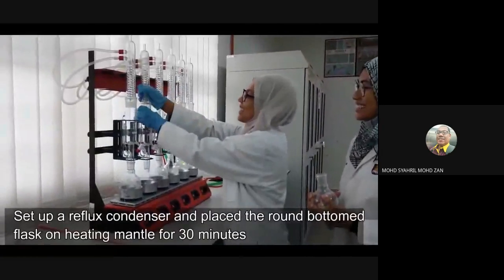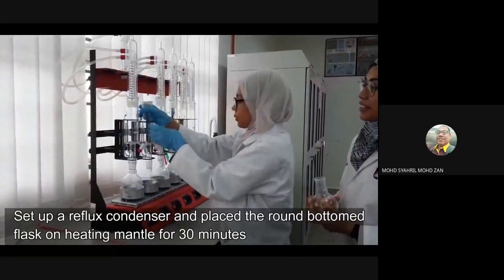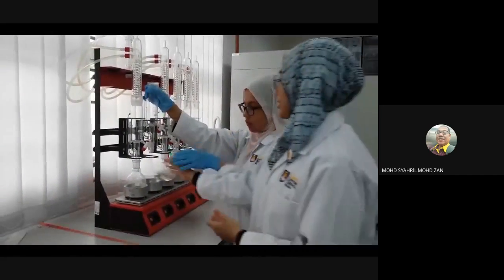Set up a reflux condenser and place the round bottom flask on the heating mantle for 30 minutes.